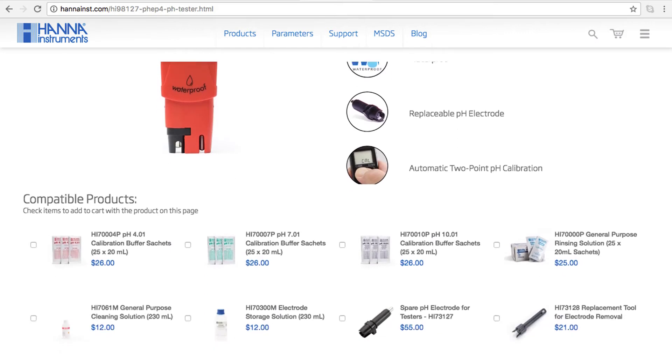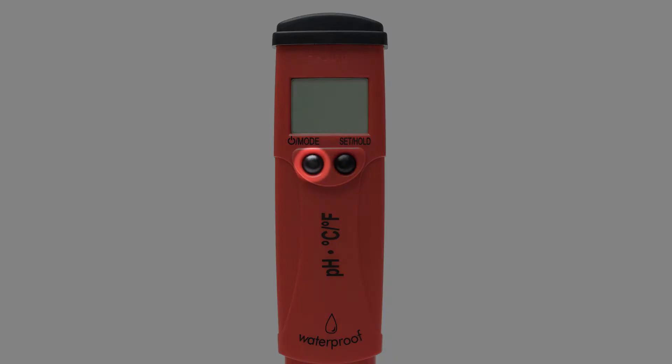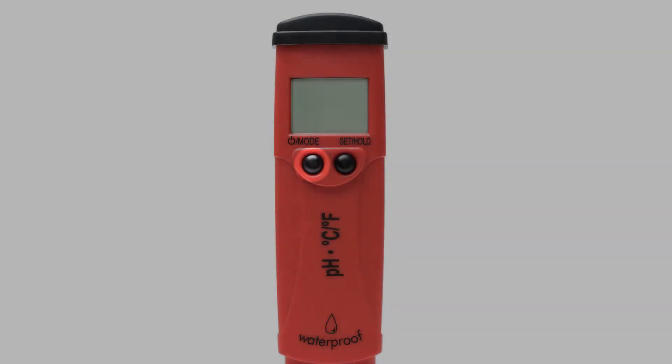If you need any solutions, you can find everything for your tester right on the product site. To calibrate your meter, press the mode button for three seconds until 'cal' is displayed.